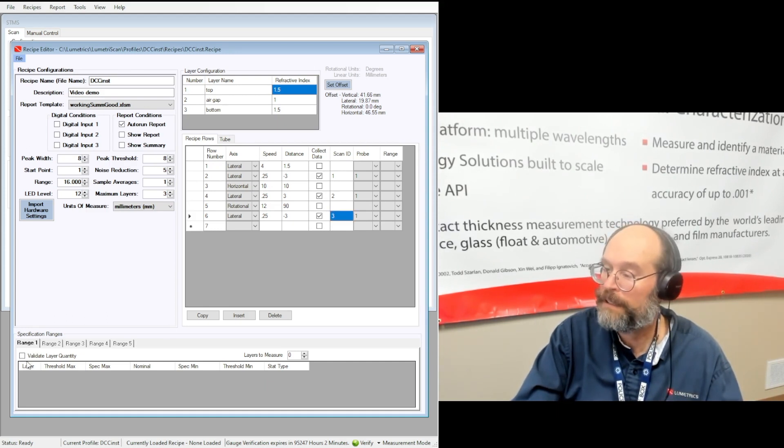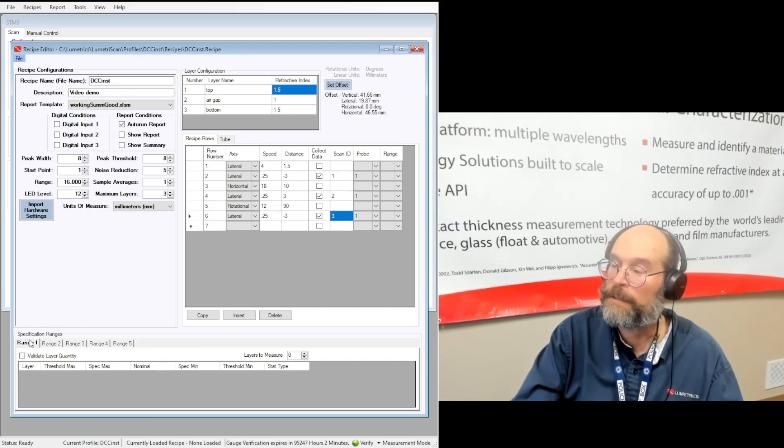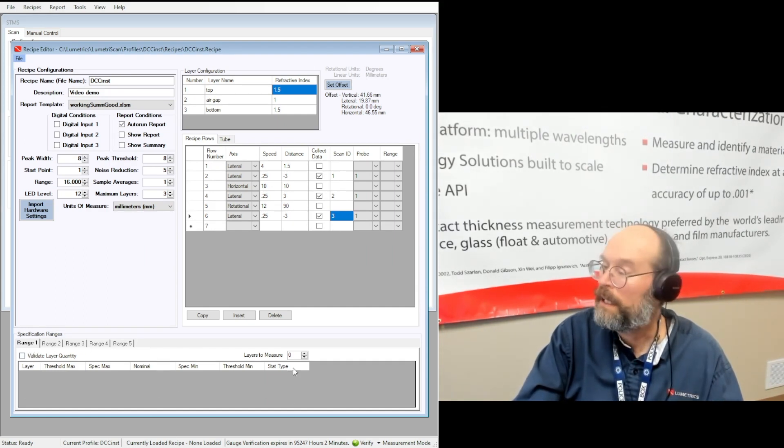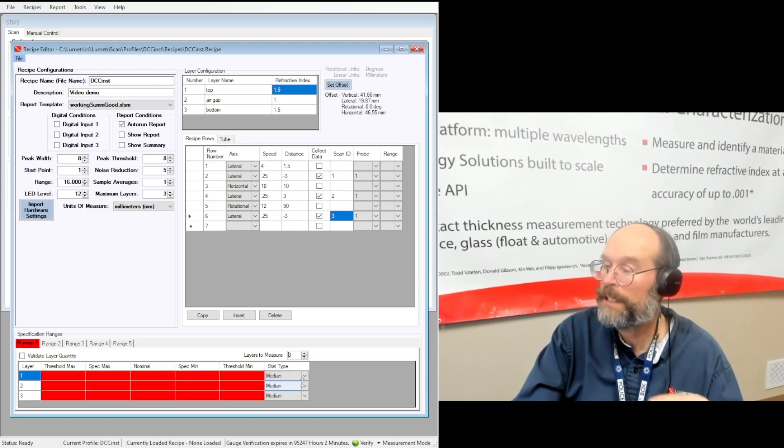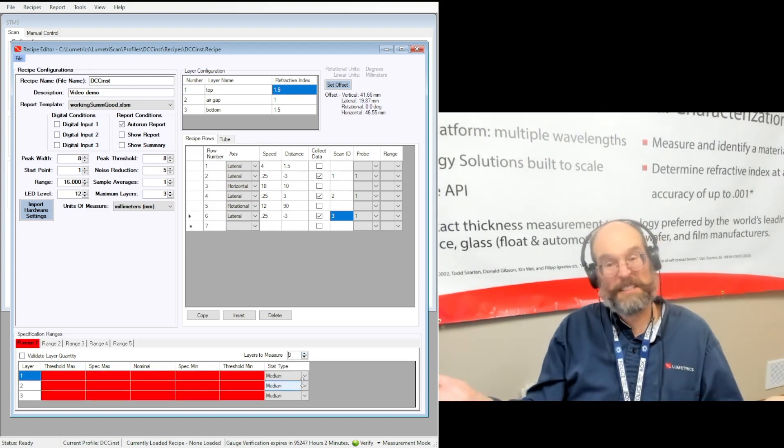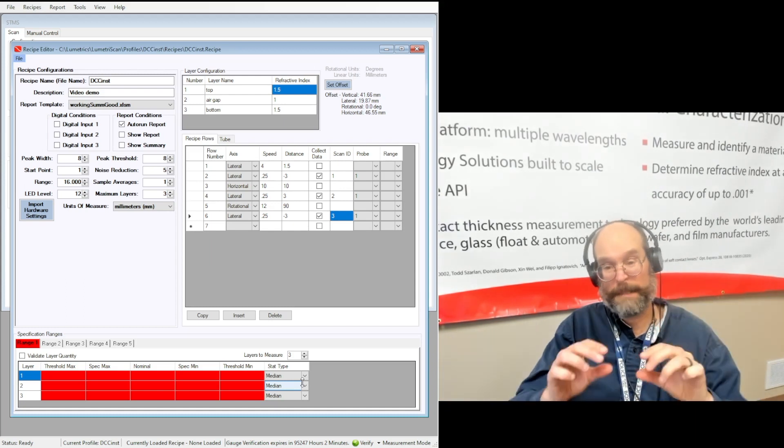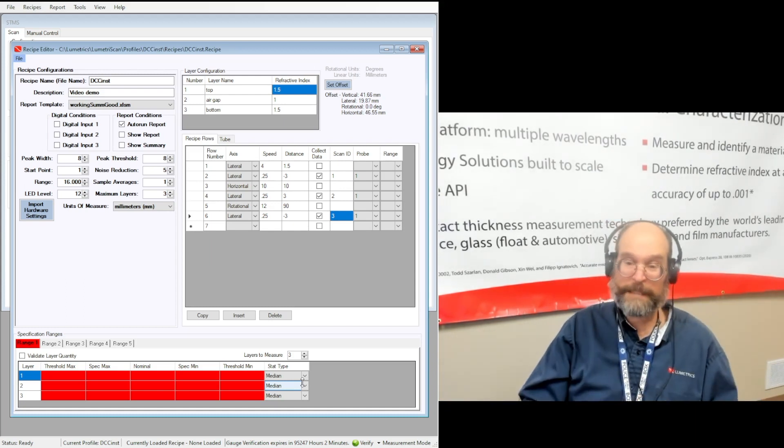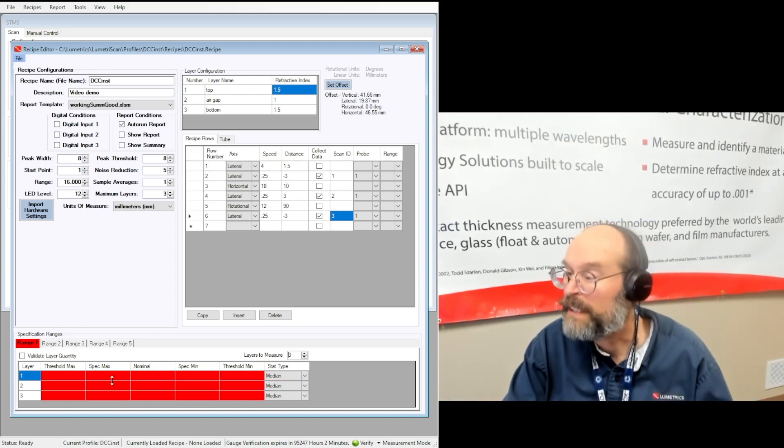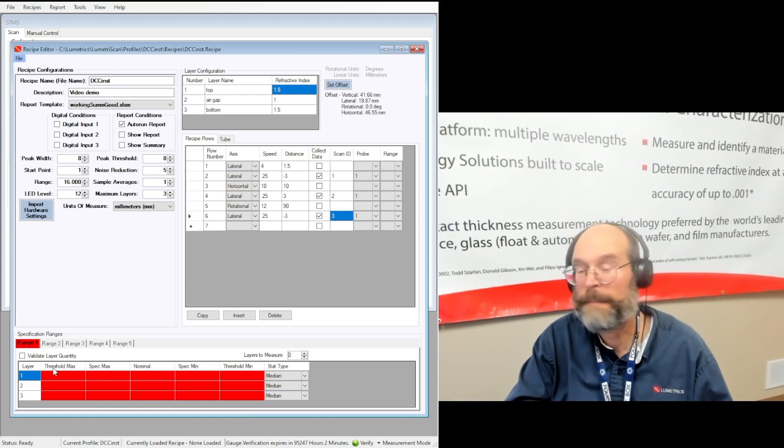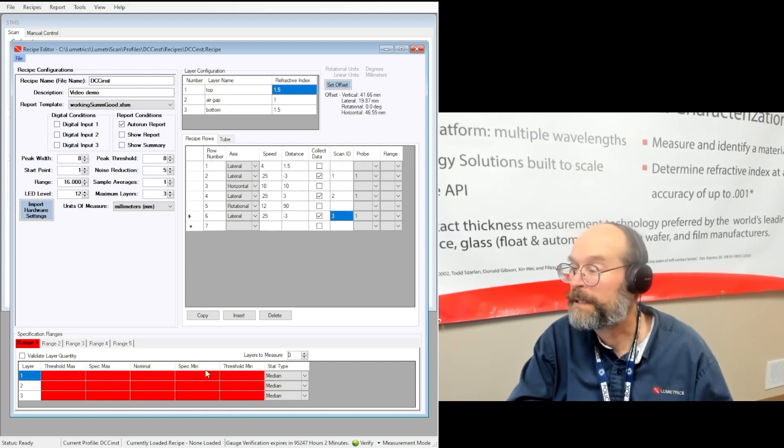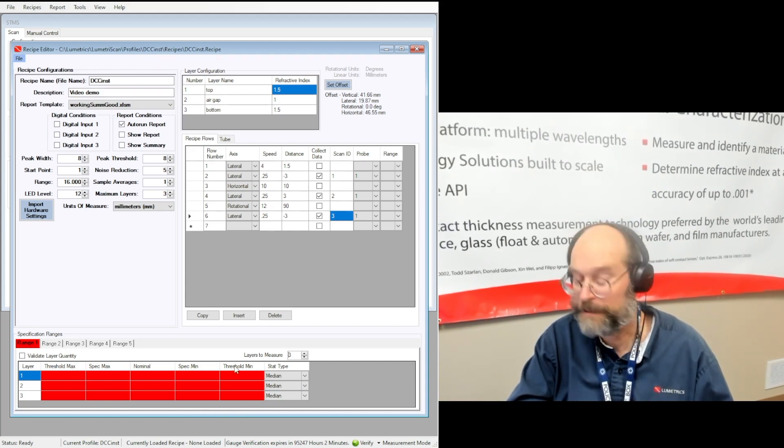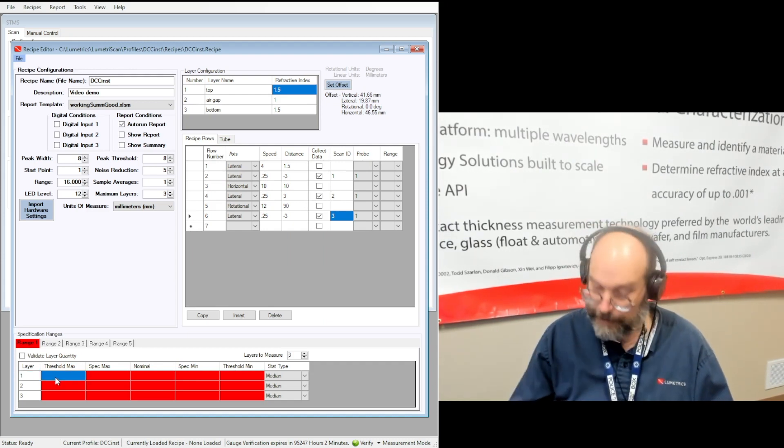So we got range down here is where you put in the specification ranges. So we're going to work with range one here. I'm going to say there's three layers because it's a tube, top, middle, bottom, three layers. And what you get now is you get threshold max, spec max, nominal, spec min, threshold min. So let me just go ahead and start putting in some data here.